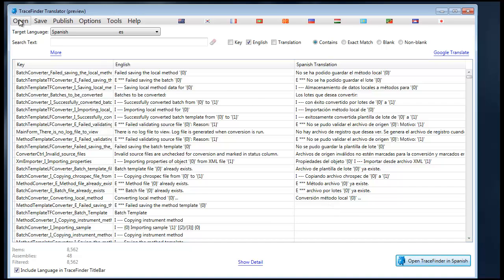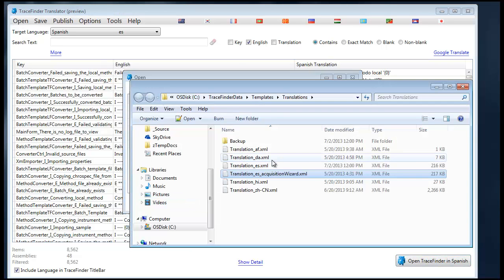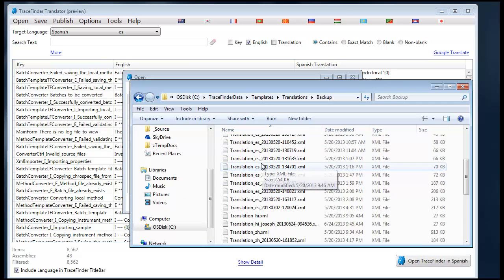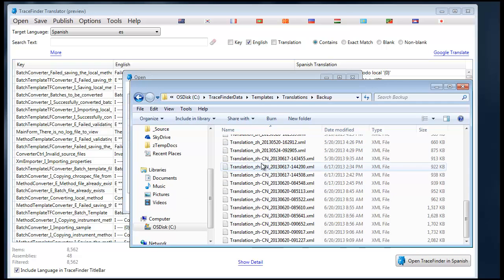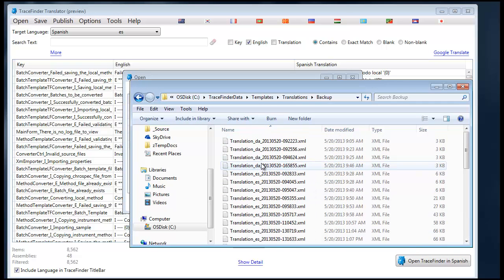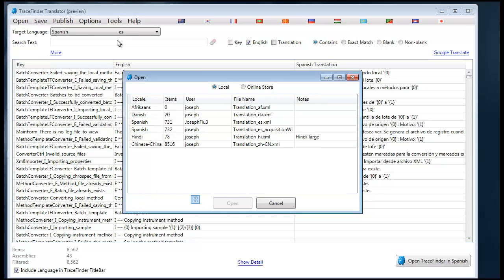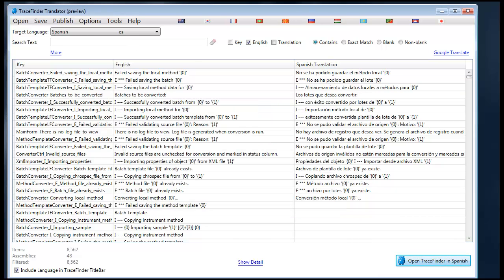That backup is created in this folder. You can notice that it has the date, time, and locale code, so that you don't lose any valuable information during translation.